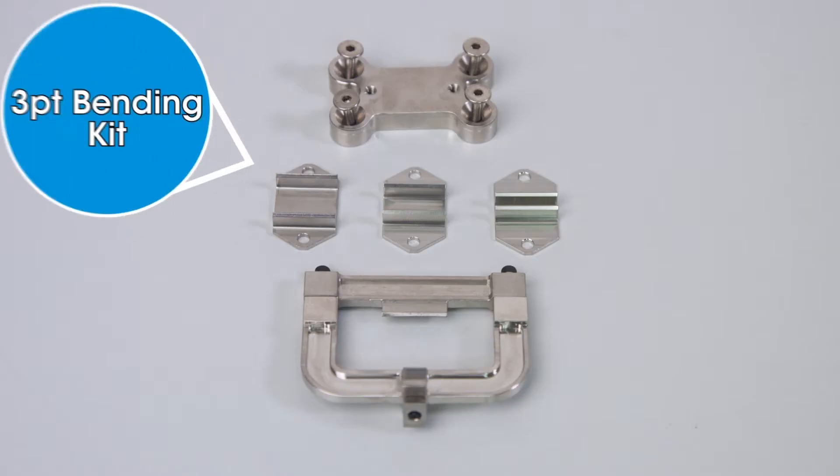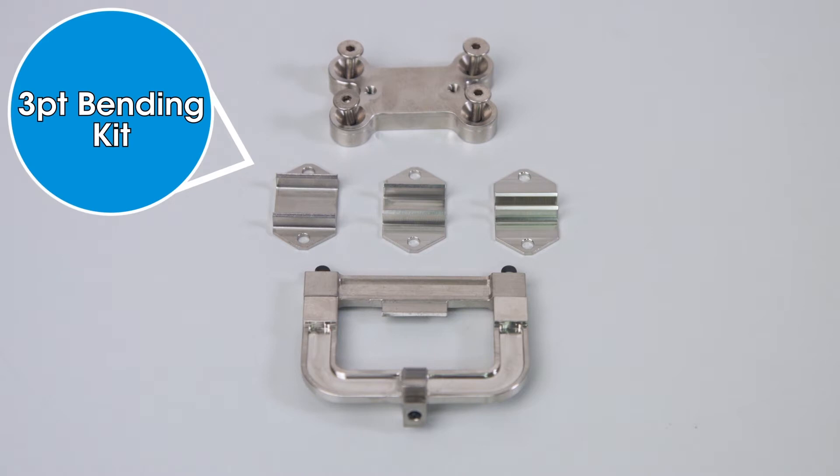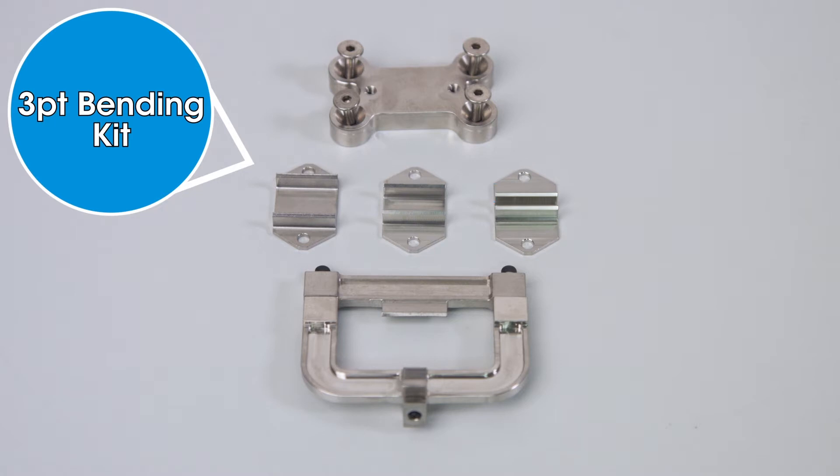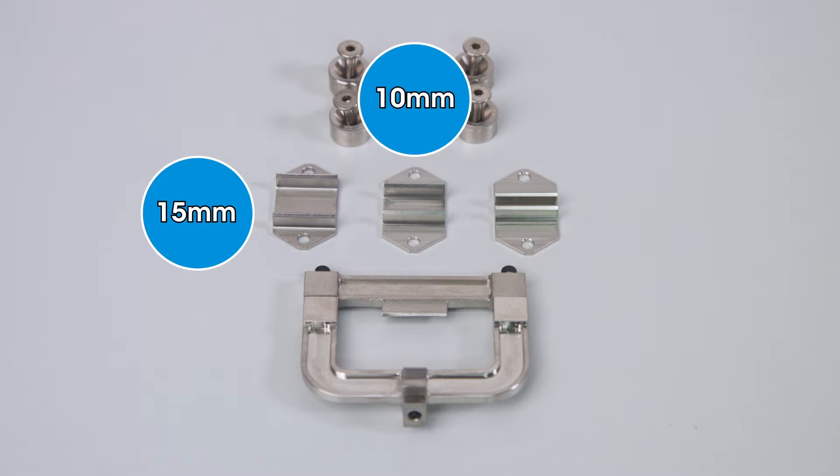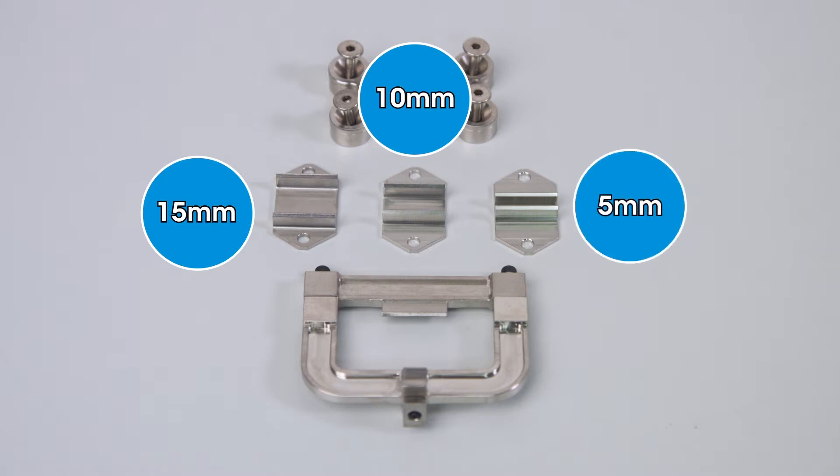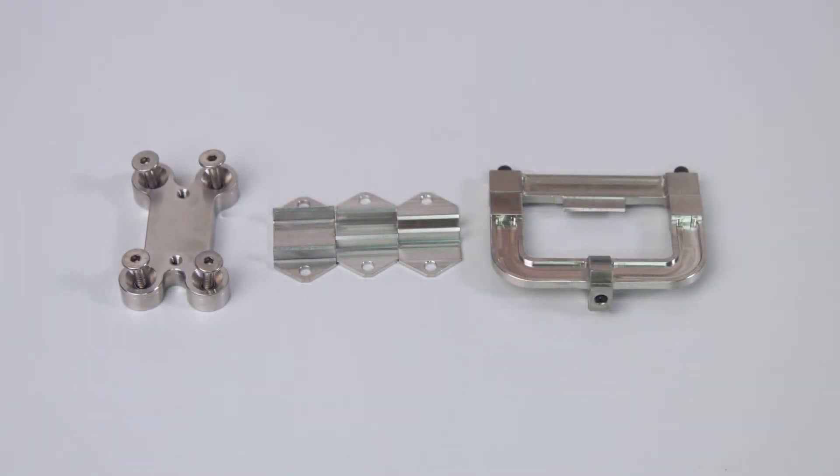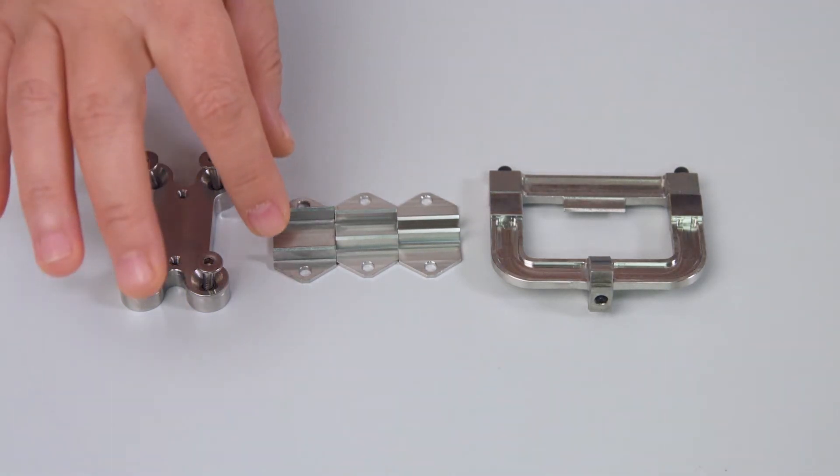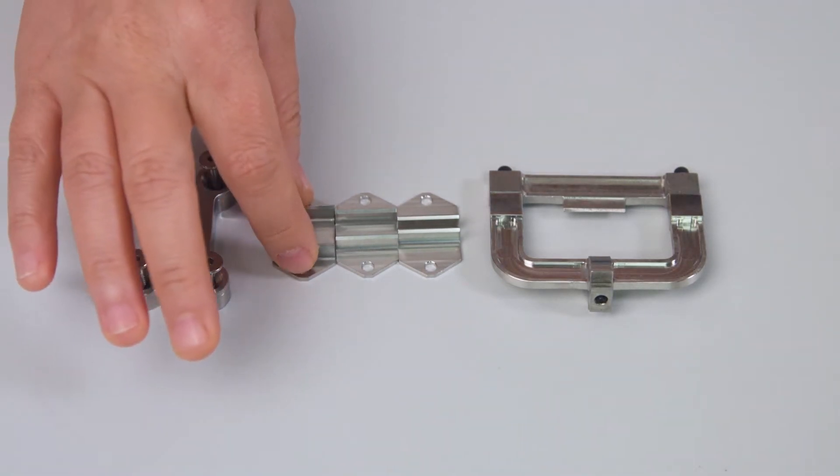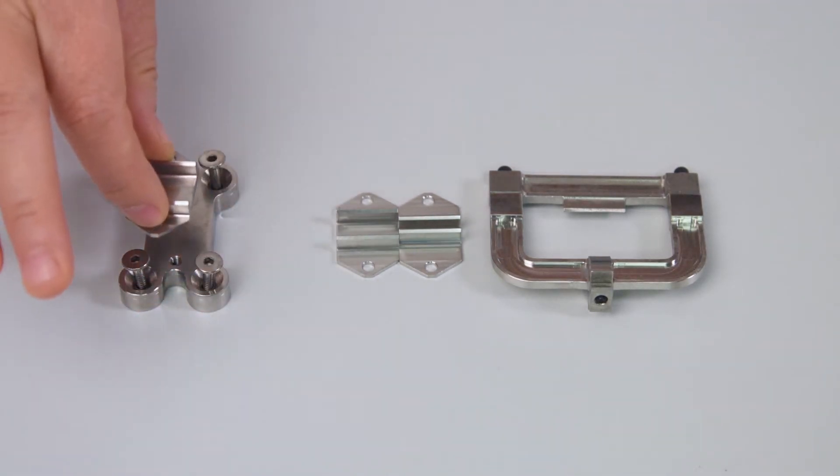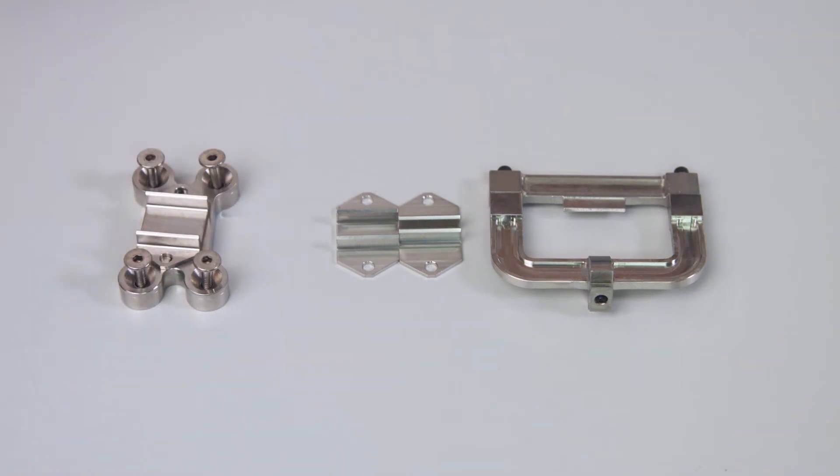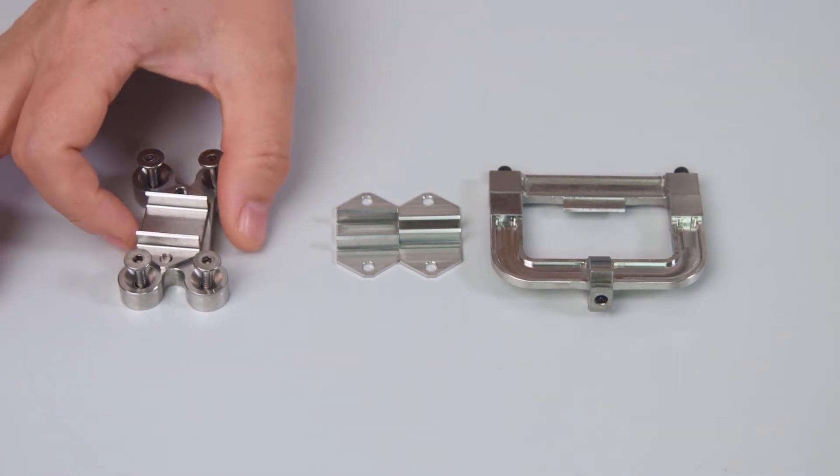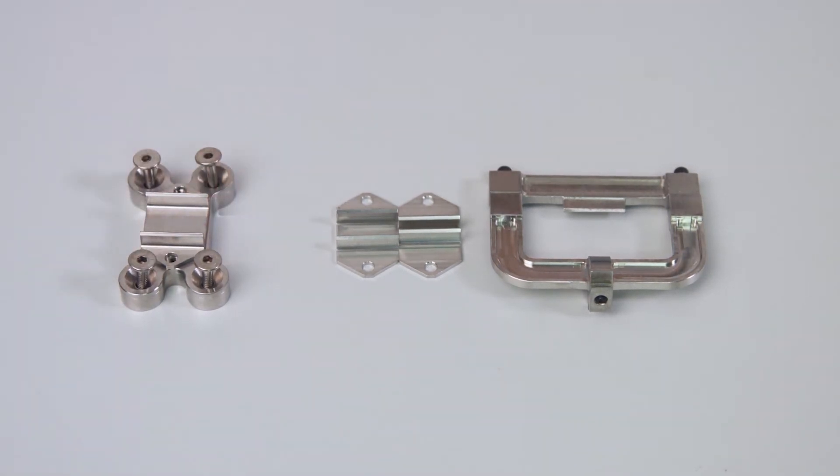In addition to these two sizes, TA Instruments also offers a package of three small size three-point bending clamps. They are 15 millimeter, 10 millimeter, and 5 millimeter. The operator can select the most appropriate span that matches the size of the sample and then mount it onto the stationary clamp before installing this small size three-point bending clamp.